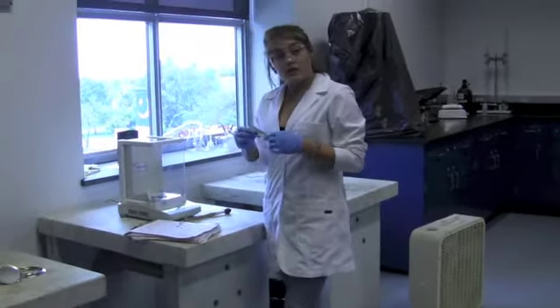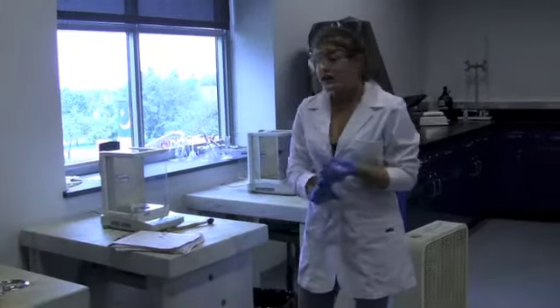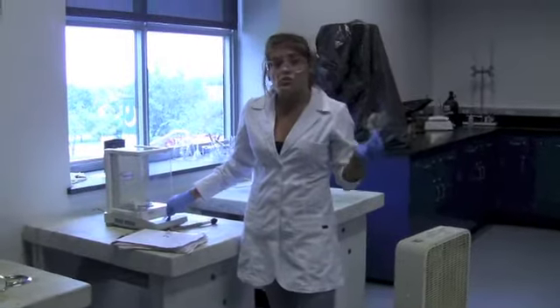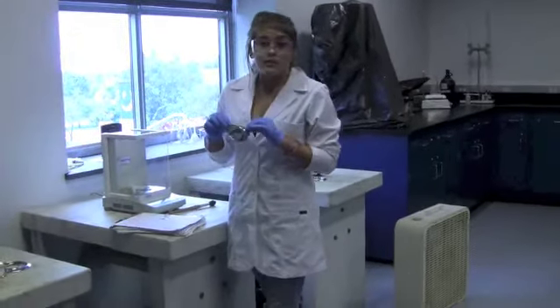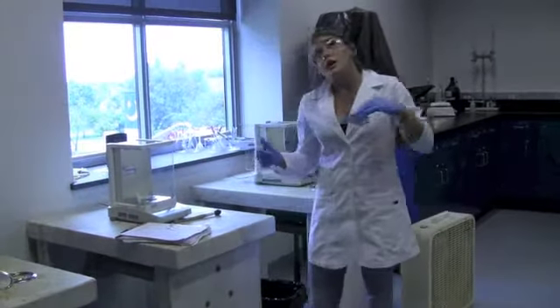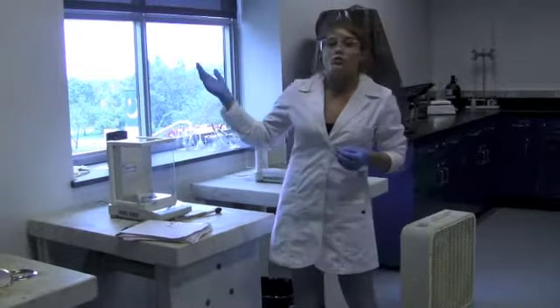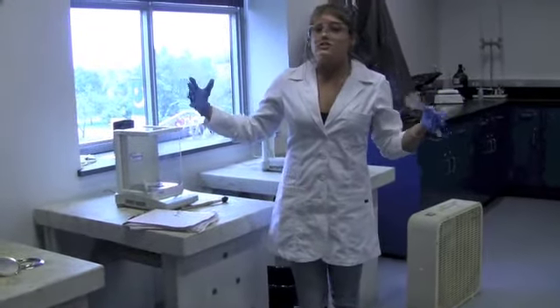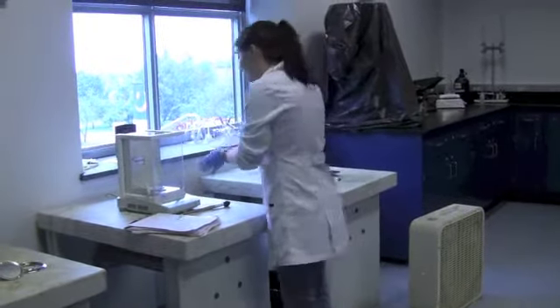Alright. When you're measuring things, always be sure to record to 4 decimal places. These scales go out to 4 decimal places, so just make sure you record the whole number. To approximate 0.5 grams, it could be anywhere from 0.4923 to 0.5127. Anywhere within the 0.5 range is acceptable. Just make sure not to be too far off.